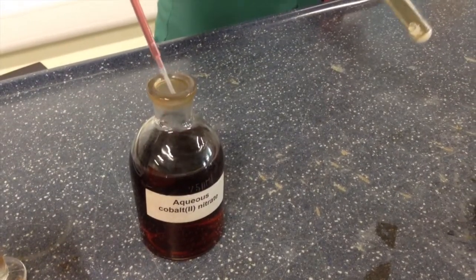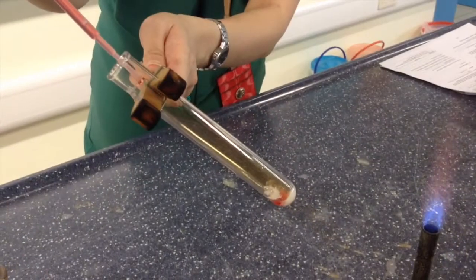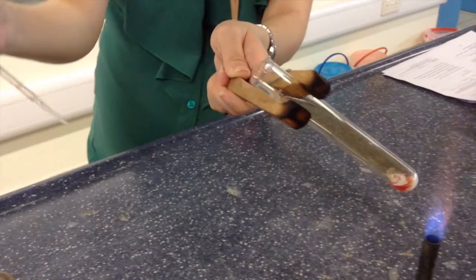Take the hard glass test tube containing the residue from question 1Ai. Add 6 to 8 drops of the aqueous cobalt nitrate.